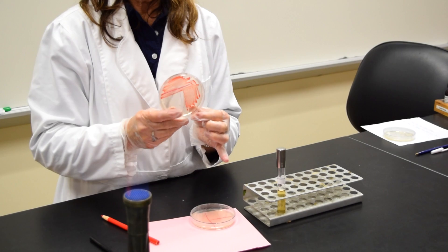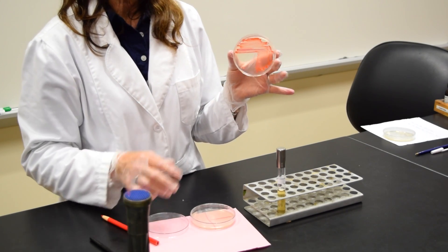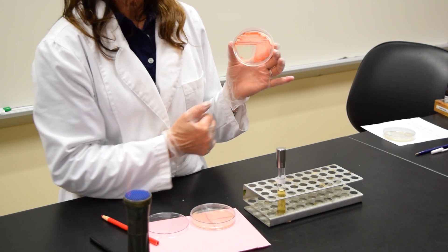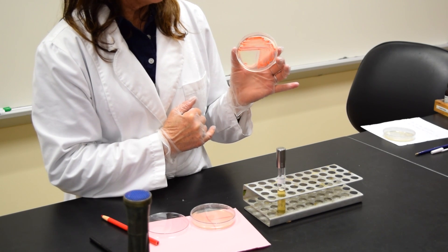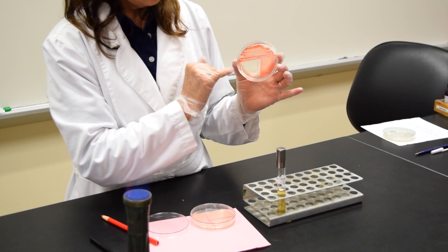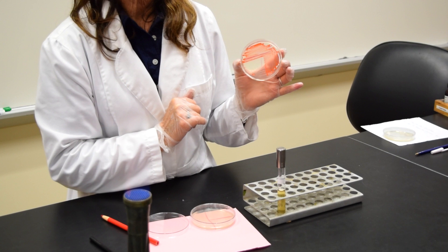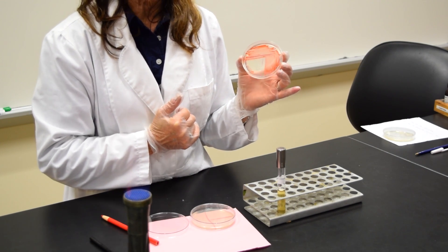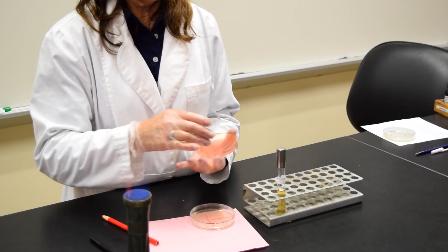When I take a look at the plate, I should notice the most number of organisms in area one. In area two, there's quite an abundance of organisms, but I begin to see individual colonies. And then in area three, I should also see some individual colonies. I've just isolated the bacteria and separated them out.